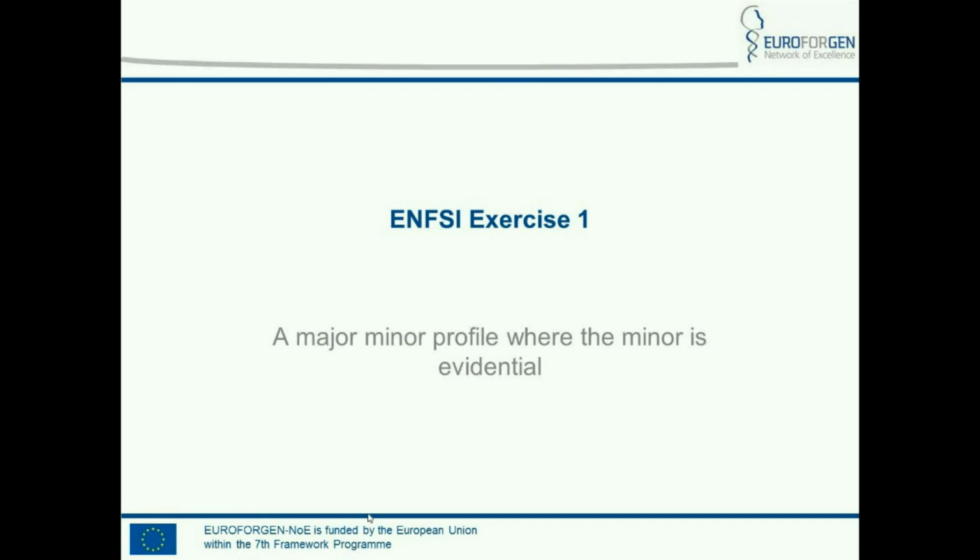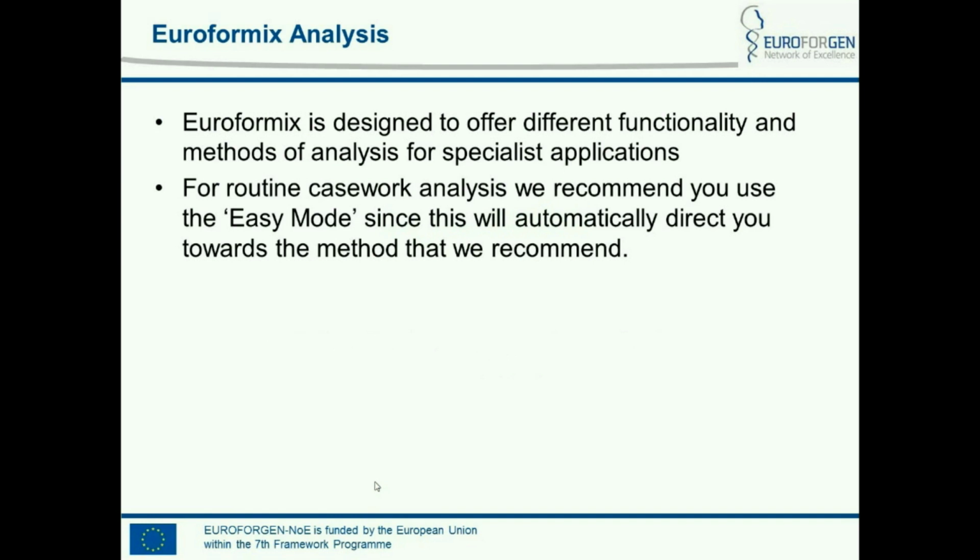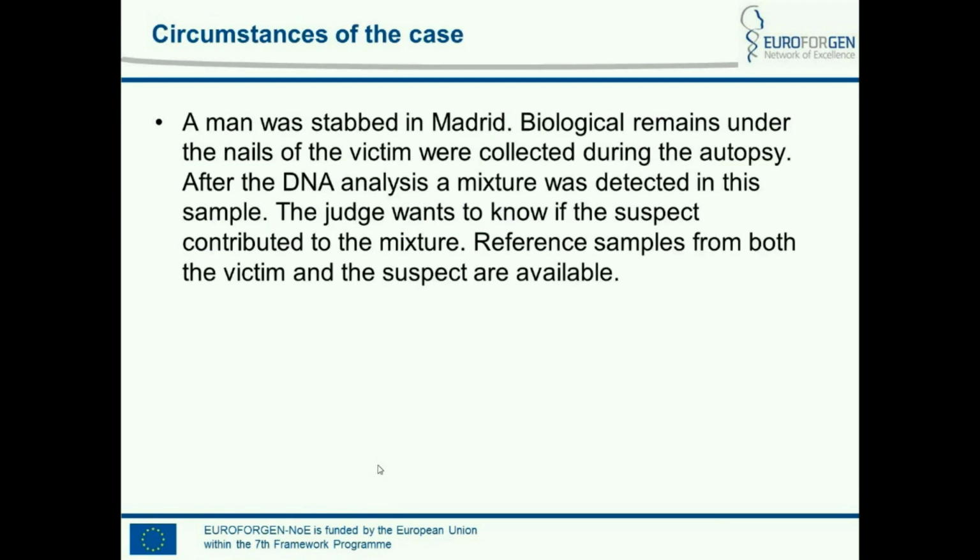I'm going to recap ENFSI exercise 1. EuroForMix is designed to offer different functionality and methods of analysis, but these are mainly for specialist applications. For routine casework analysis, we recommend that it would be much easier if you use the easy mode, because this will automatically direct you towards the method that we recommend for casework.